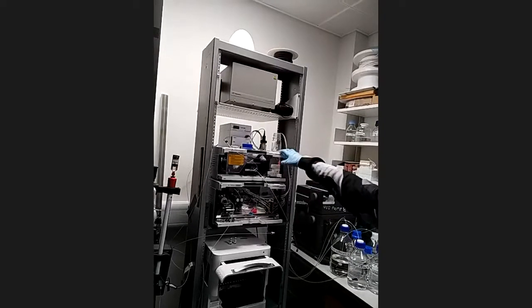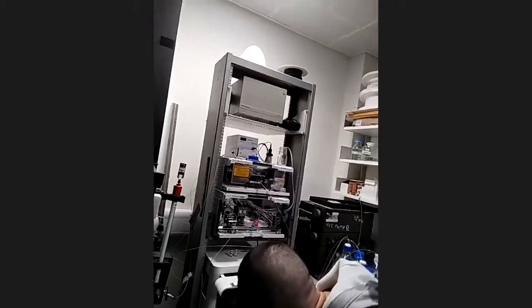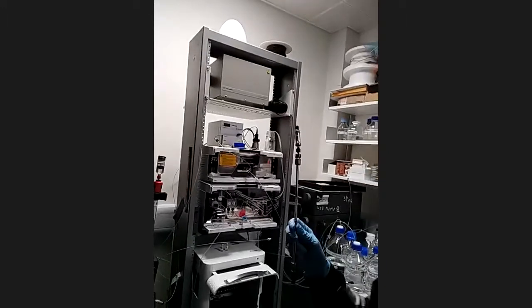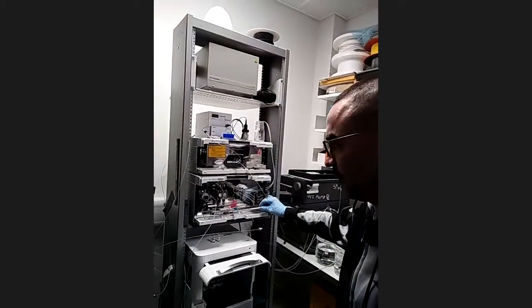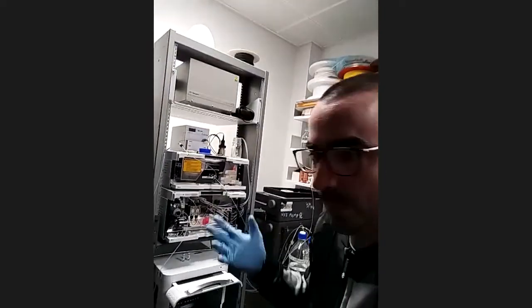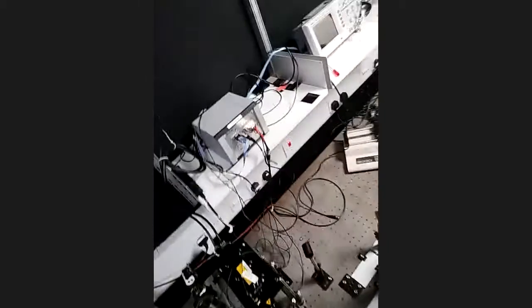Okay, so this is a chromatography system that is used to pump protein samples from this robotic thing that selects them out of vials and then injects them into a chromatography column. You will have done chromatography at some point in your science education, where proteins or some molecule is separated out by some property of it. In this case, I don't know, size or something like this. And then that's injected into the system here that we built.